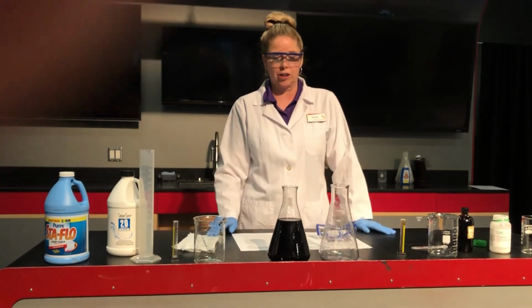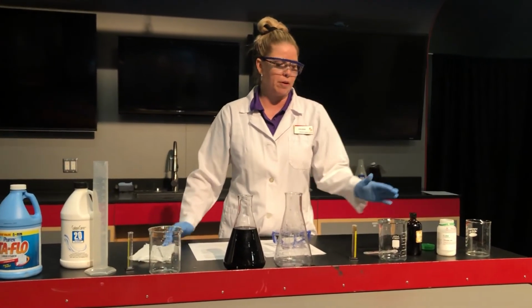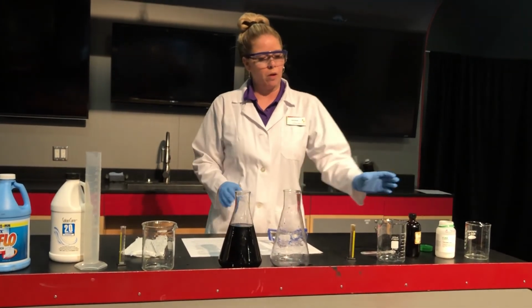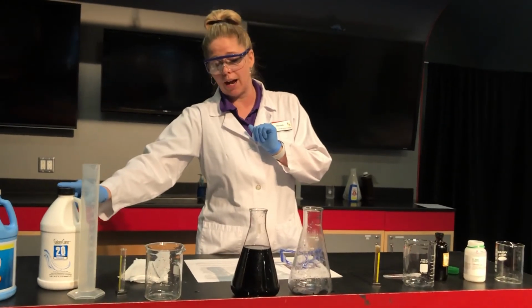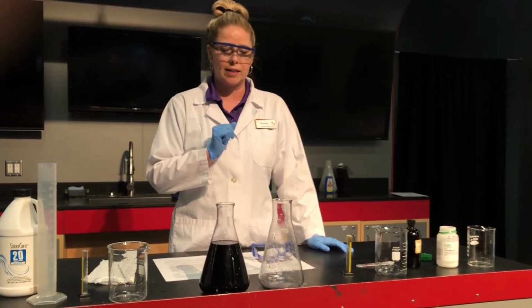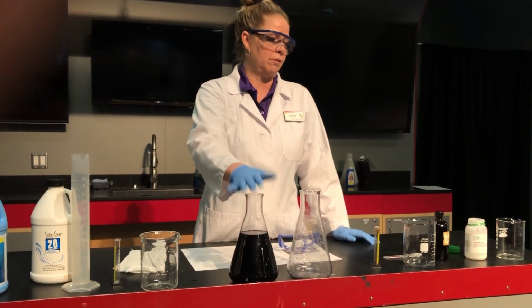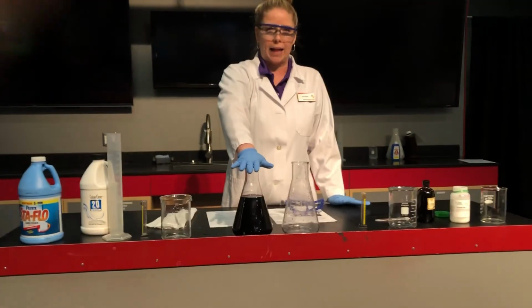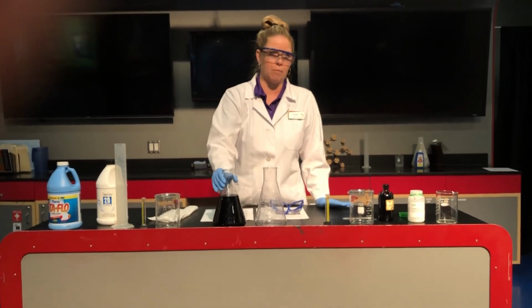And this timed reaction is all about the iodine. So when we added the iodine in the ascorbic acid, remember that the ascorbic acid made it turn clear, right? And it's kind of keeping it in that clear form. Once we add that iodine mixture to the hydrogen peroxide, it's what's eating away at the vitamin C tablet, at the ascorbic acid, and once that's all gone, then it's gonna turn back to a brown color. Now, this isn't brown. Our brown iodine actually reacts with the starch and turns this almost black, deep purple color. So we have a number of reactions happening that created our big color change.